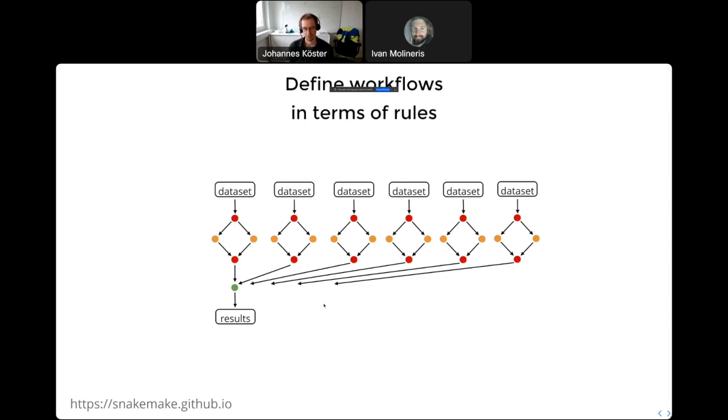So first of all, it's a matter of convenience, a matter of self-documentation, but also it's a matter of transparency and reproducibility, because you don't have to document this connection so much. You have all the capabilities that Snakemake offers in terms of reporting, so that you get an integrated overall report that entails not only the primary analysis steps, but also every single line of code that is used to generate the final plots of the manuscript.